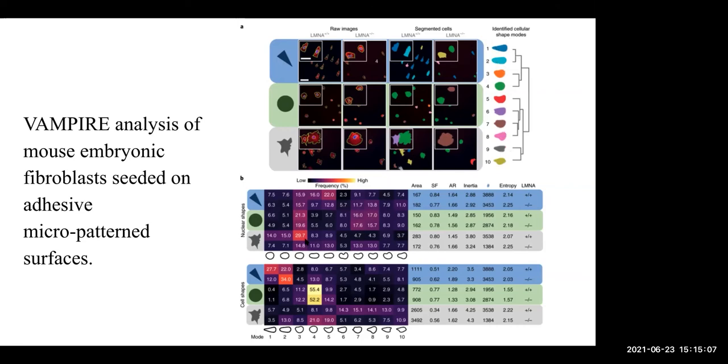And these cells are color coded based on the shape modes that are extracted at the end. And these tables here show the frequency of cell distributions with the cell shapes and the nuclear shapes. And these are the traditional geometric parameters that are calculated for the same cells. As you can see, this analysis shows the predominance of this shape mode in all these cells and the traditional parameters don't show any difference.